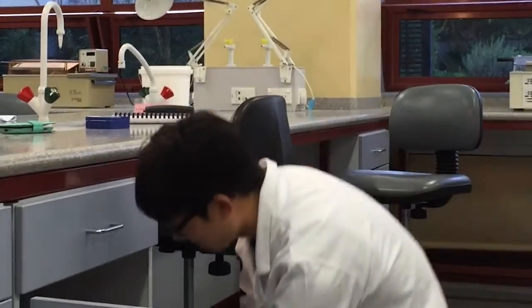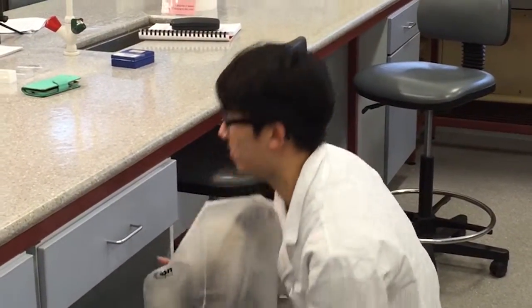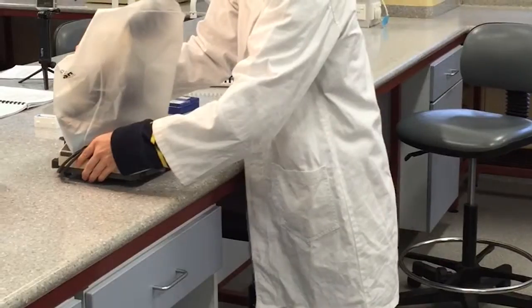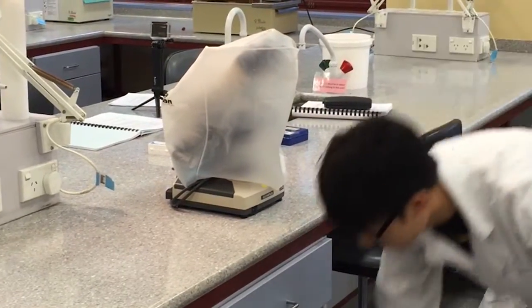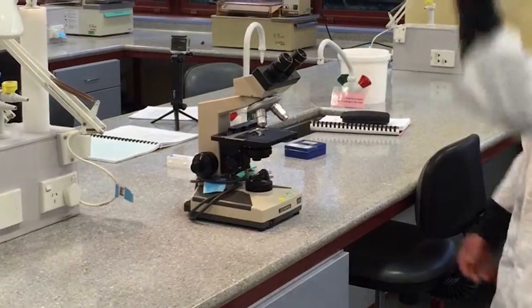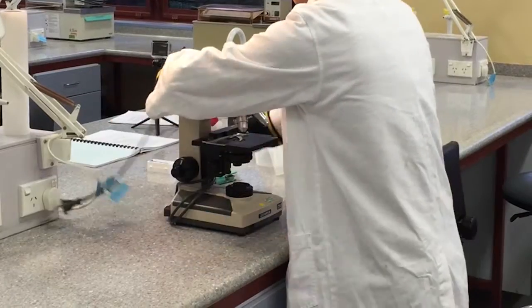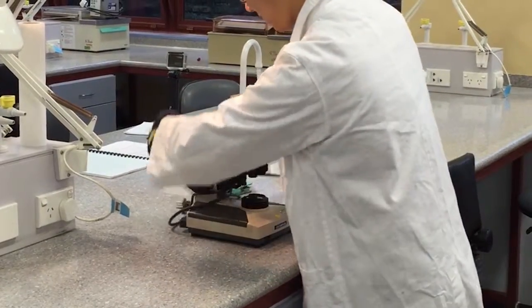The compound microscope is found in the locker under the desk. When moving it, always ensure it has been lifted by the arm with one hand on the base. Place it softly on the desk. Remove the plastic covering. Unwind the power cord and plug it into a reliable power source before switching it on.